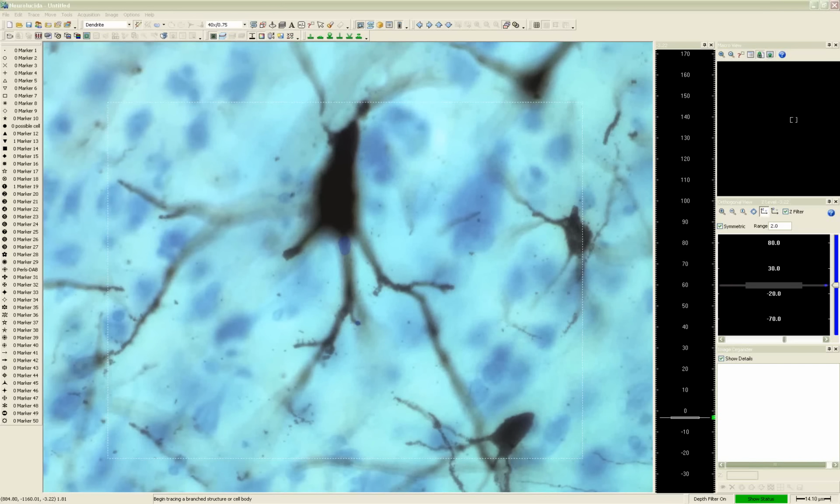There's been a couple of questions about things moving or shifting when you're tracing and you have to realign the tracing with your structure. That is best solved by doing a very accurate calibration. So those 5 calibration steps that I talked about, revisit those.